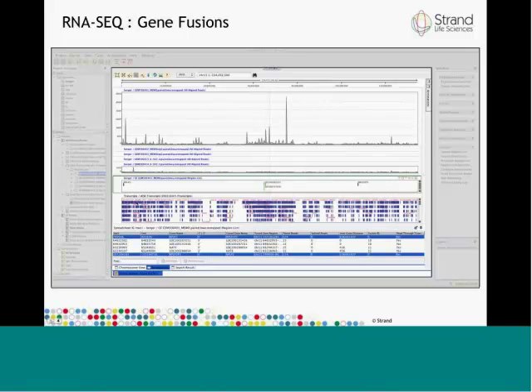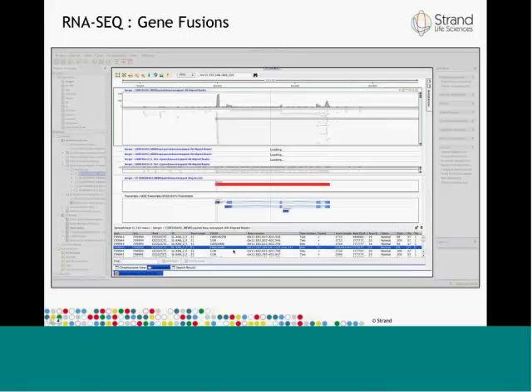You could zoom into one of those regions, and then you can see again that there are several reads here that have dotted lines going across this gene, right? These dotted lines stretch across the gene to further away.